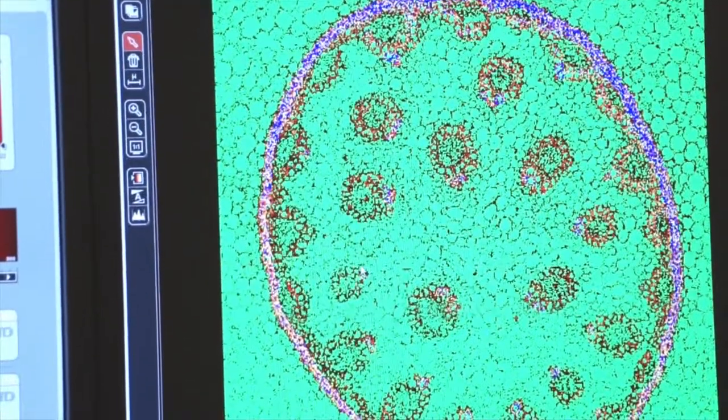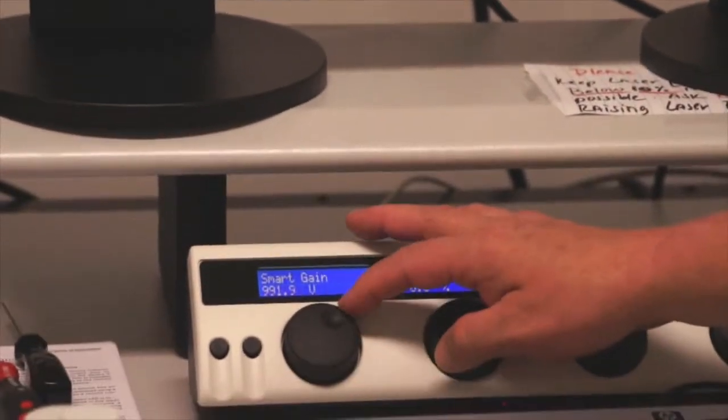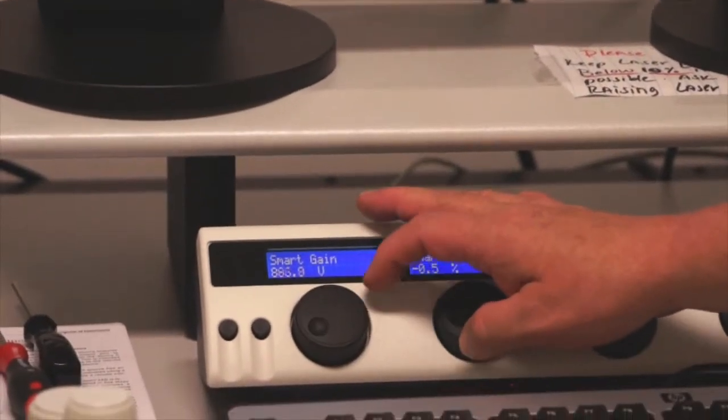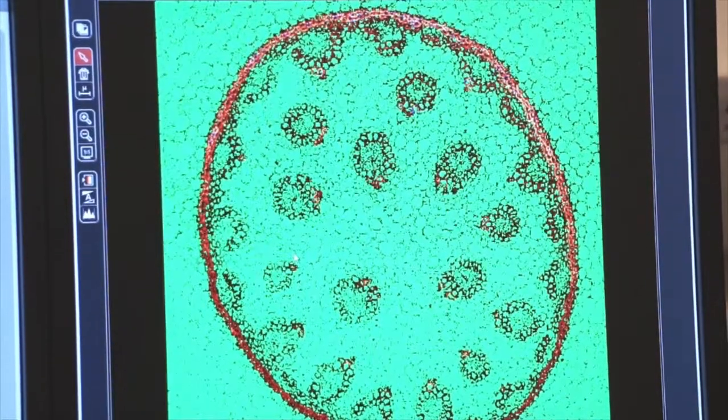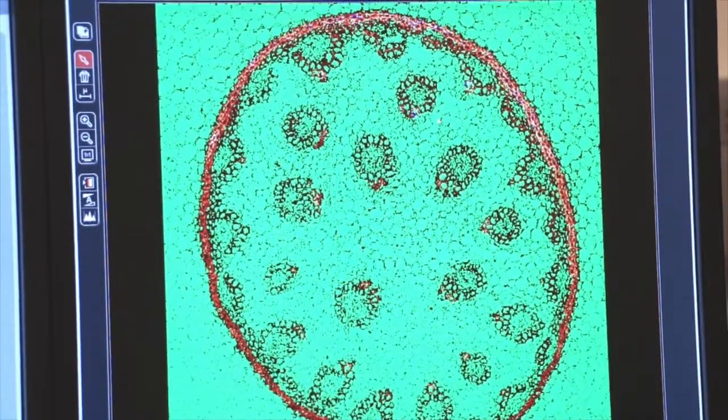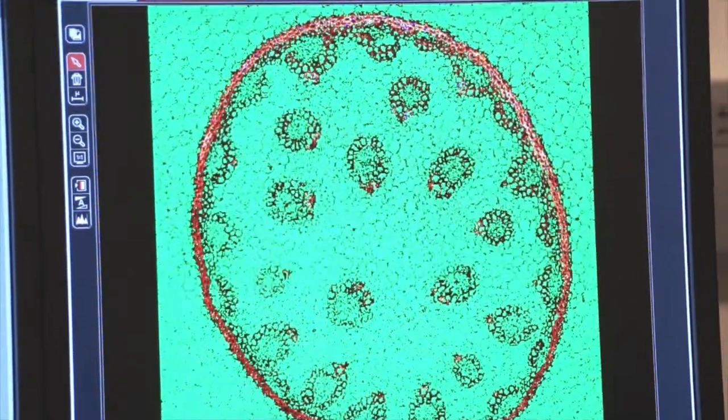Your gain control will change the number of blue pixels in your image and you want to turn the gain down until you have only a few blue pixels. As you can see here at about 891, I'm starting to see a few blue pixels in my image.